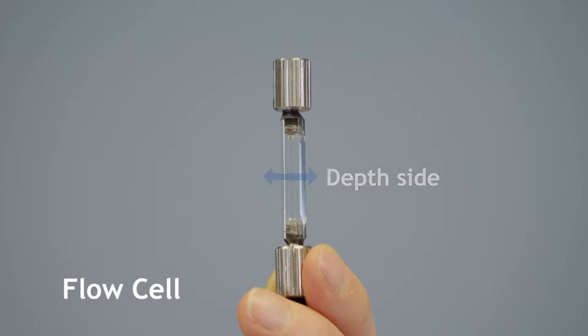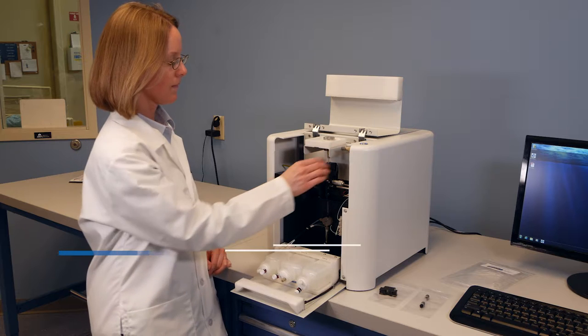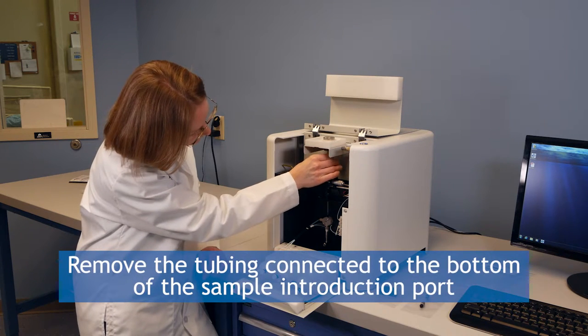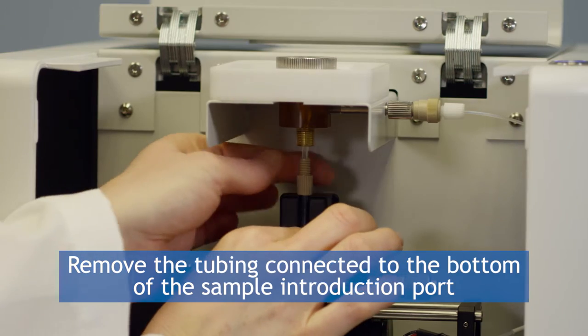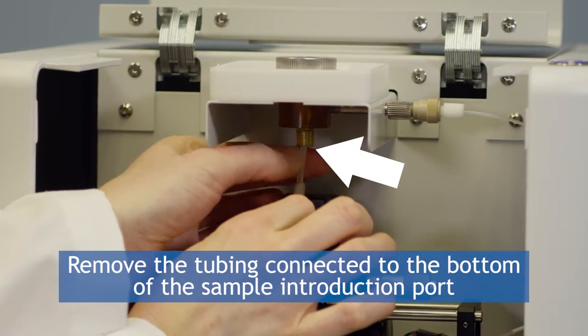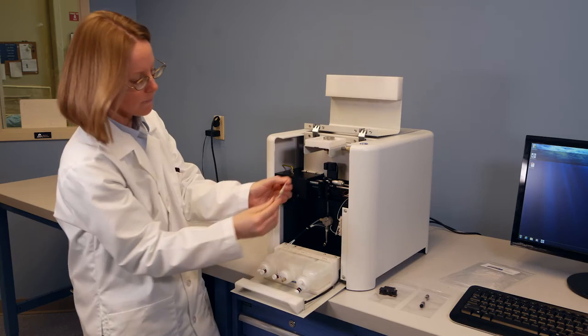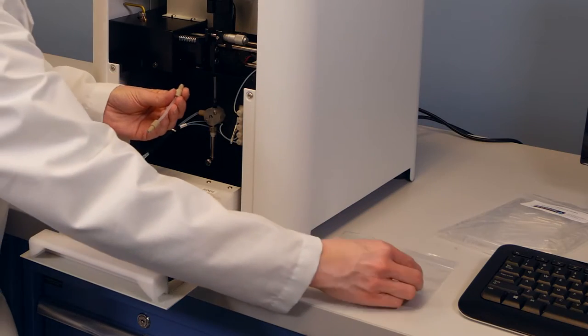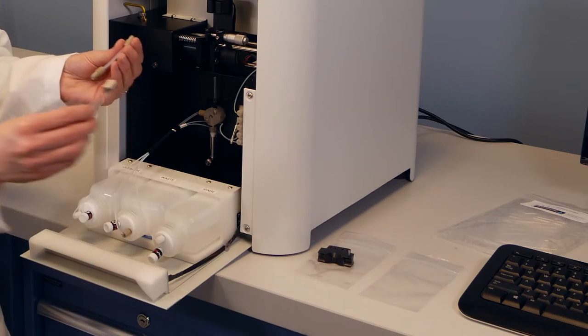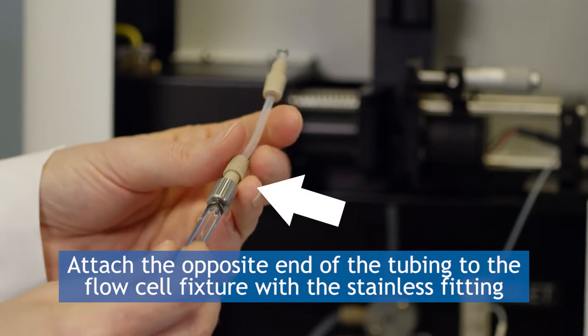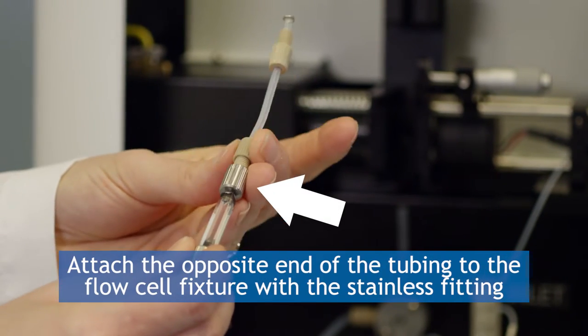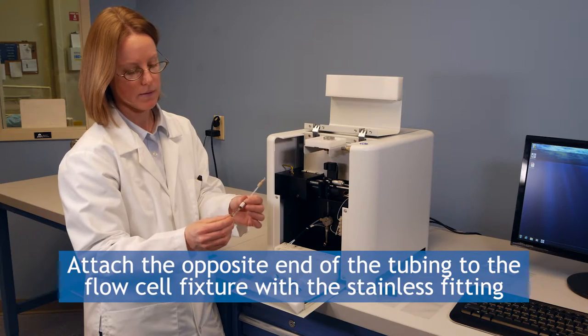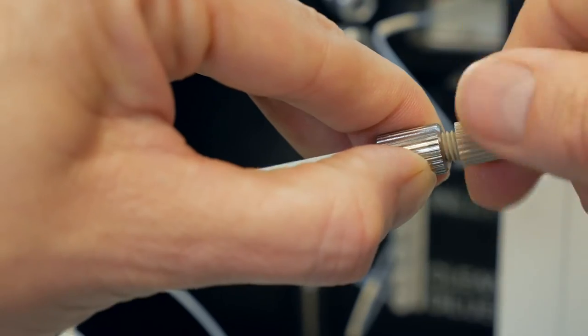When you are installing the flow cell, look directly at the glass portion and you should see two thin lines which correspond to the internal edges of the glass flow cell chamber. If you see one thin line, it is installed incorrectly. Remove the piece of tubing connected directly to the lower portion of the sample introduction port. Attach the opposite end of the tubing to the end of the flow cell fixture with the stainless fitting only. Once properly tightened, you should hear a click.